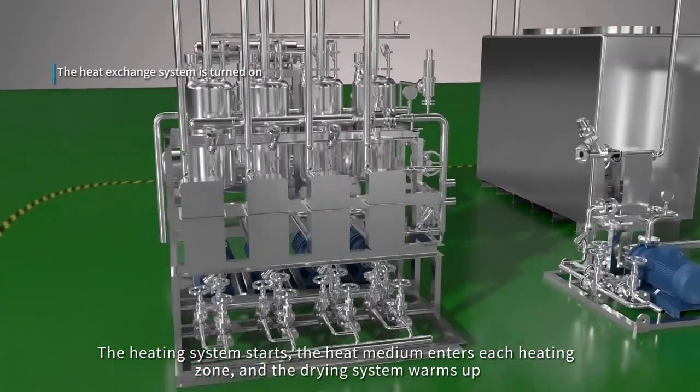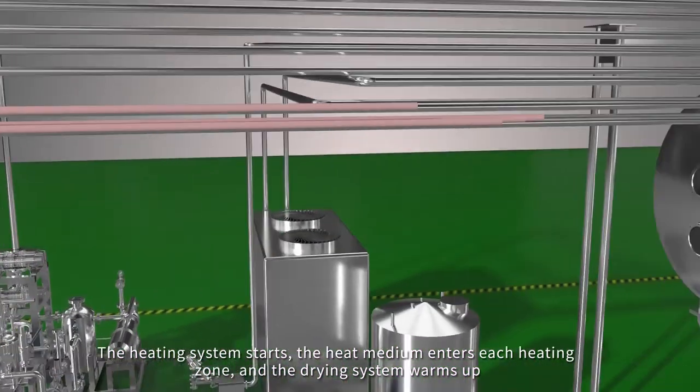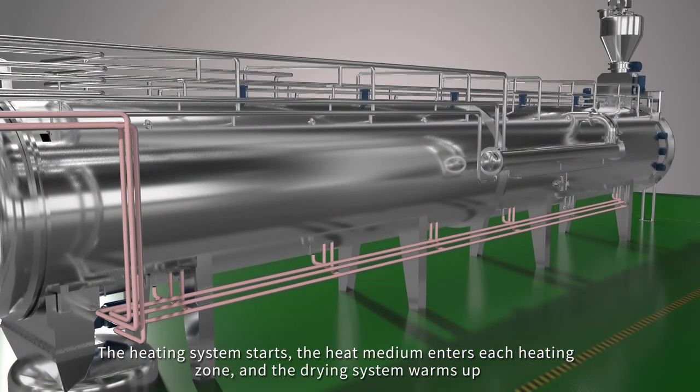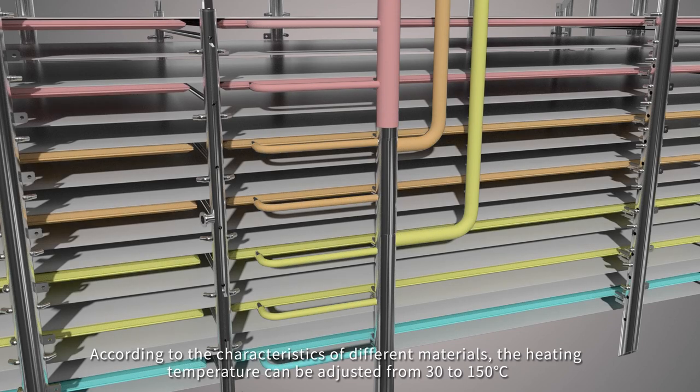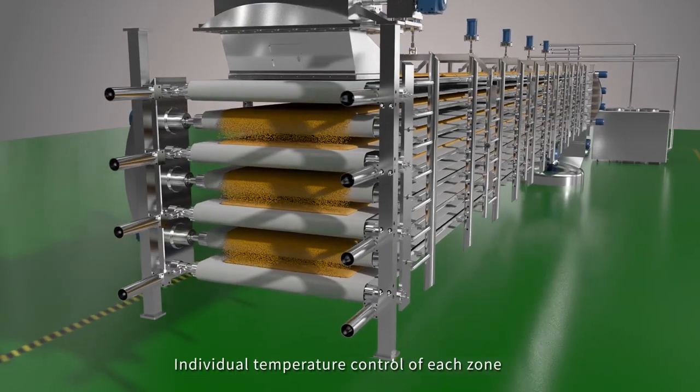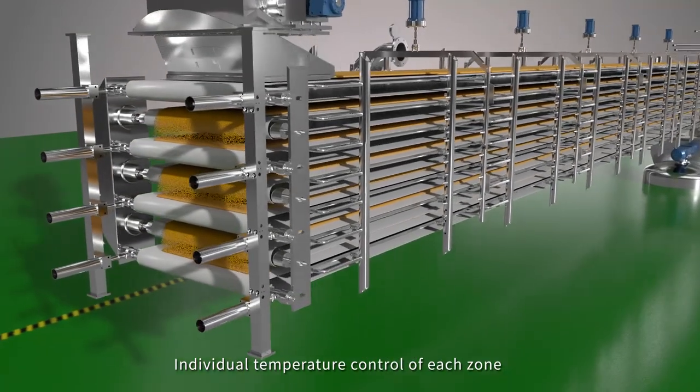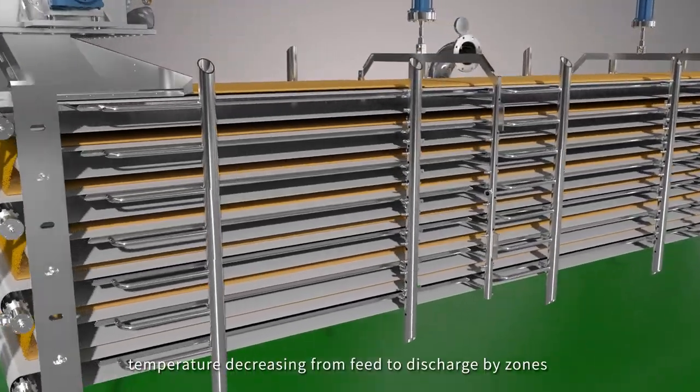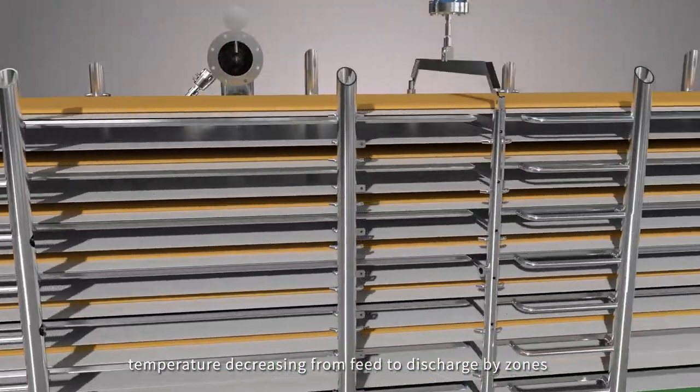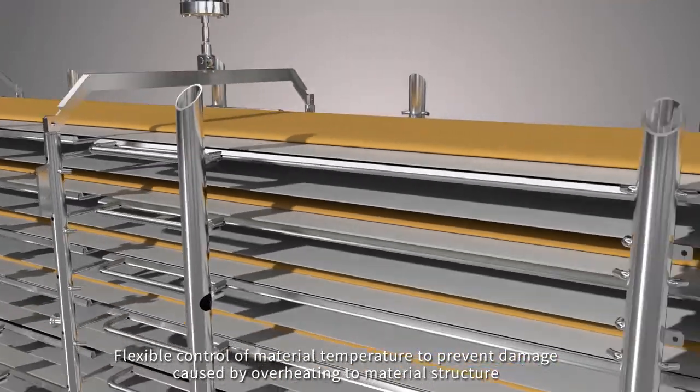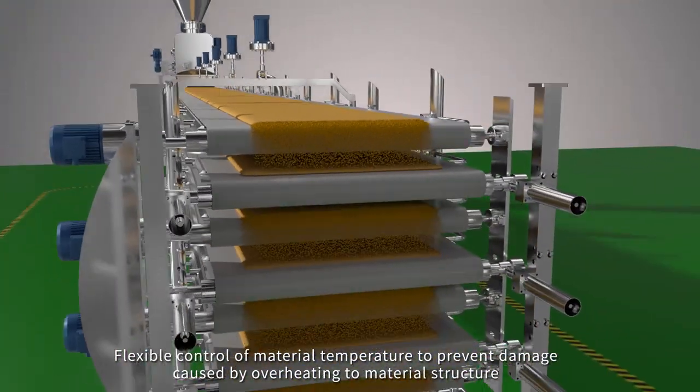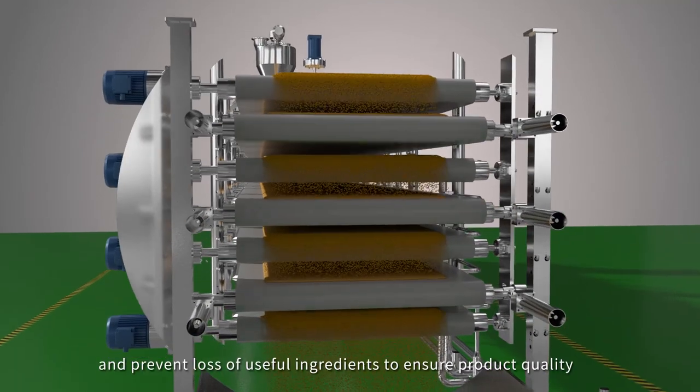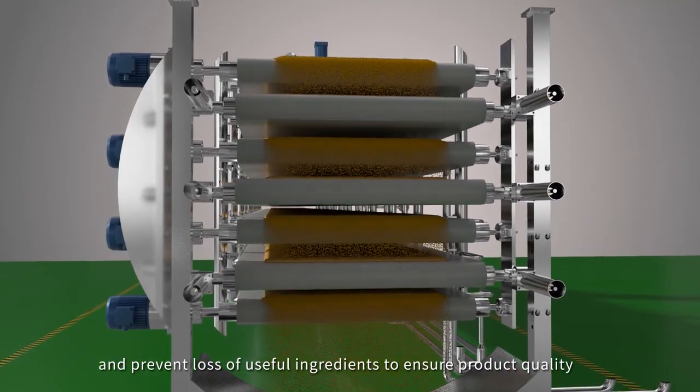The heating system starts, the heat medium enters each heating zone, and the drying system warms up. According to the characteristics of different materials, the heating temperature can be adjusted from 30 to 150 degrees Celsius. Individual temperature control of each zone. Temperature decreasing from feed to discharge by zones. Flexible control of material temperature to prevent damage caused by overheating to material structure and prevent loss of useful ingredients to ensure product quality.